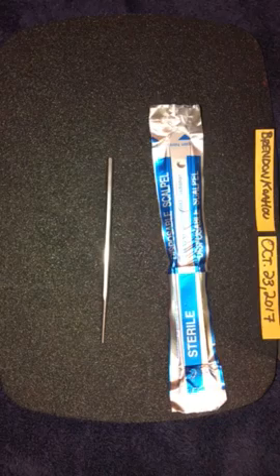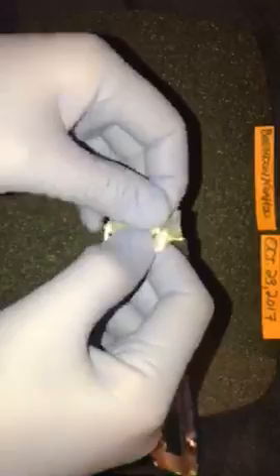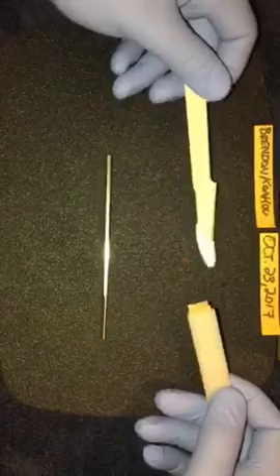There's a towel under my workstation here just because the sheep's brain has a lot of fluids. Start off by opening my scalpel. Very nice. Nothing like that new scalpel smell. New scalpel. Obviously I'm wearing gloves during this procedure. I'm also wearing off-camera protective eyewear. So there's my new scalpel.